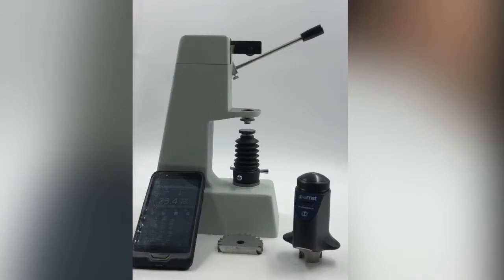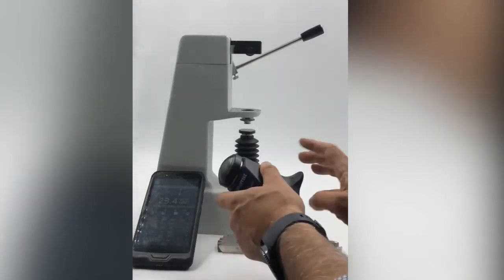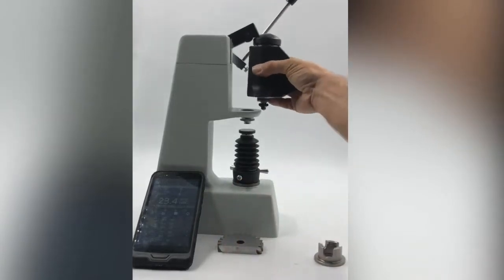To achieve even higher accuracy, we can transform our portable unit into a bench instrument. It's very simple — just remove the standard base and place the instrument on the bench for stable benchtop measurements.